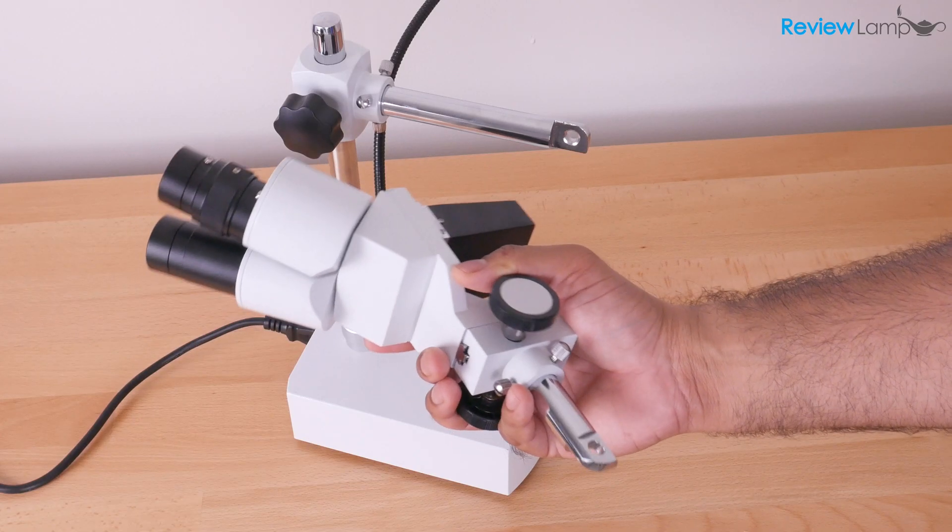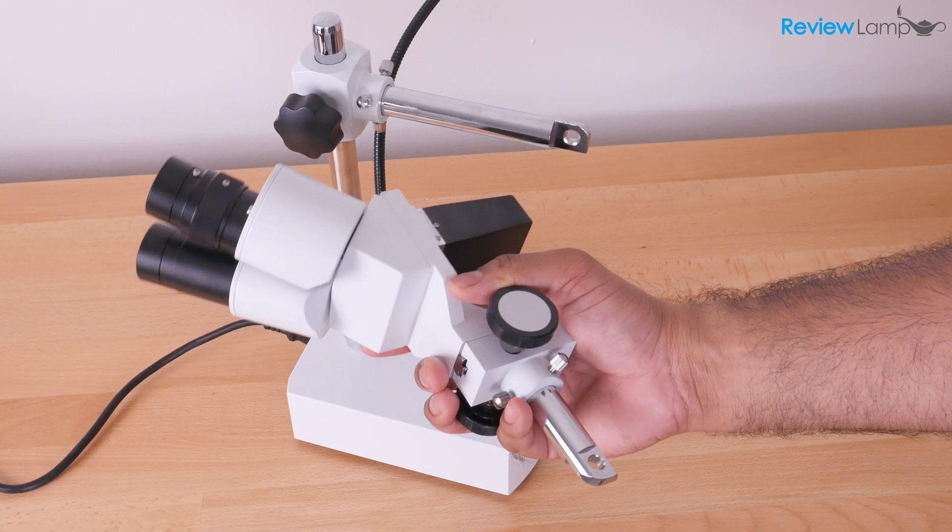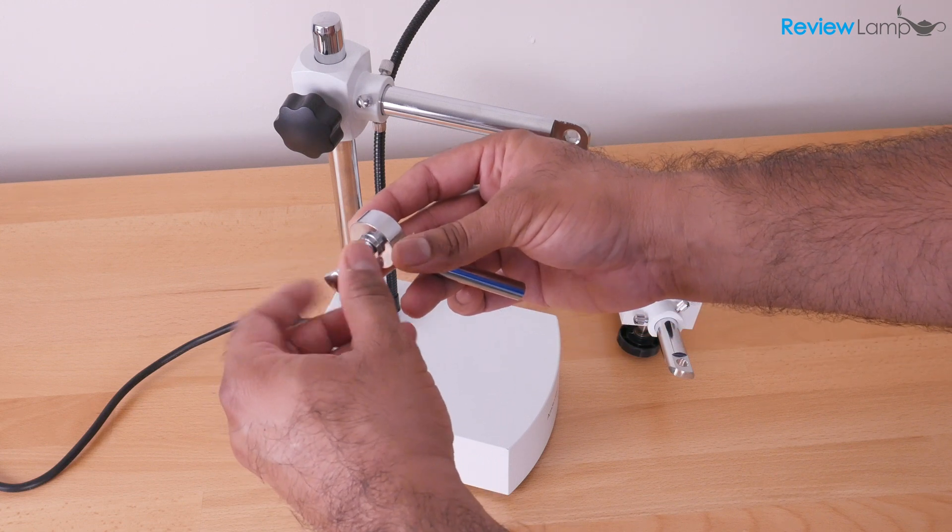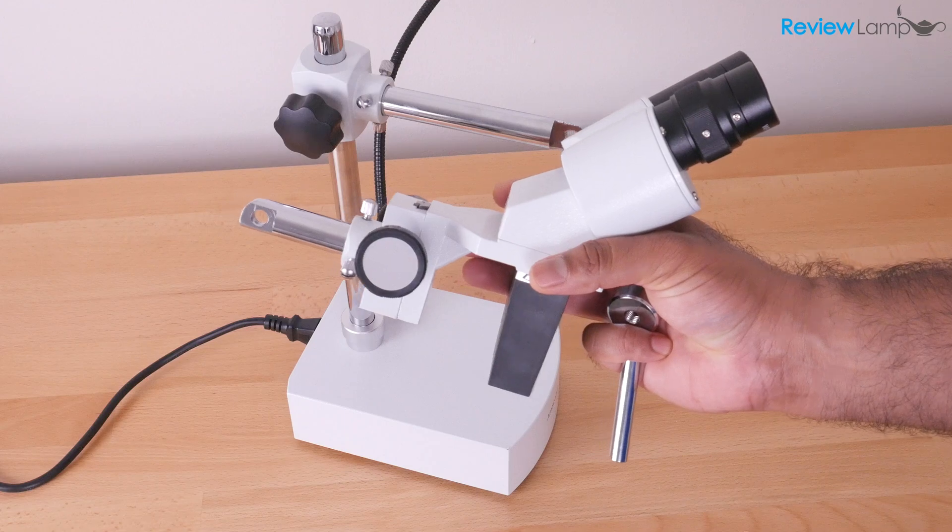In the next step, we're going to attach the microscope head to the stand. And to do this, we're going to unscrew the bolt that is screwed into the handle, separate those, and grab your microscope head.